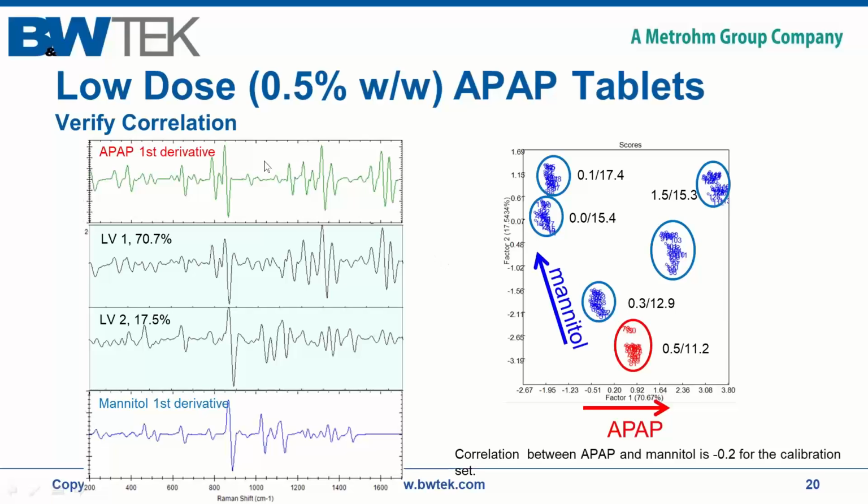So let me go back to here. So here we have our model. We looked at our model carefully in terms of the error for one thing, but also what signal is being modeled. Does it relate to the components that we are modeling? So there are numerous considerations in that respect. So the error of your reference method, the signal that you're modeling, the percent variance that you're modeling, and also your cross-validation. So by explaining more variance in your data, are you able to predict samples better, or do you introduce more error in your predictions?